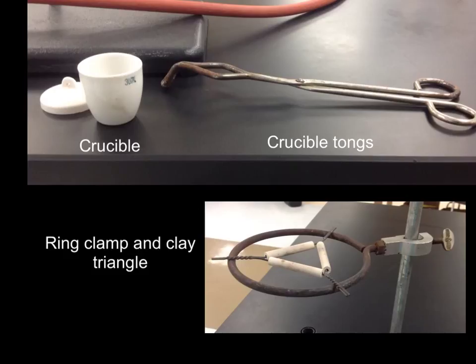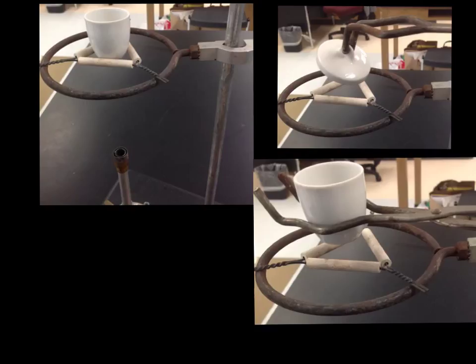One other use for a ring stand is to use something called a crucible, and the crucible is the small little porcelain container you see. It is used specifically for heating up solids, and there are a specific set of tongs that are used with the crucible, called crucible tongs, and then you also need a ring clamp attached to your ring stand and a clay triangle. So to set up the crucible, you want to put it in the clay triangle, which is sitting on the ring stand, and you could suspend it above a Bunsen burner because you're going to be heating what's in the crucible.